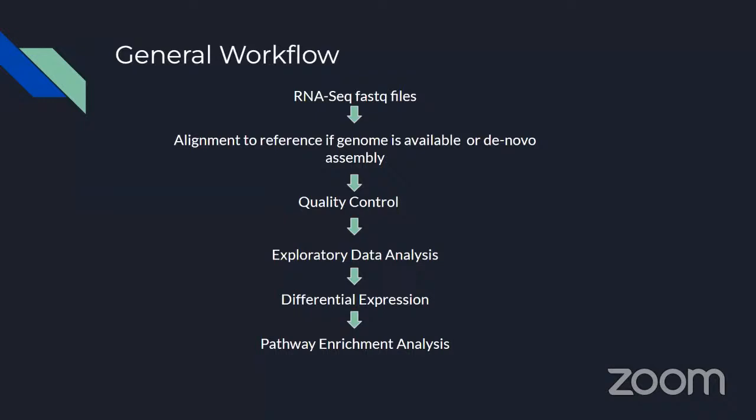So exploratory data analysis is something that validates your hypothesis that this particular condition, or this particular perturbation, has actually changed the cells, or you could actually visualize it, and again that can act as a quality control.